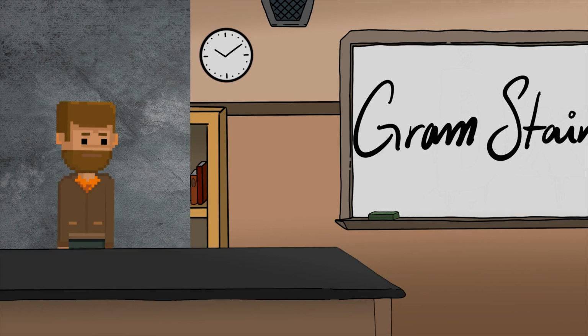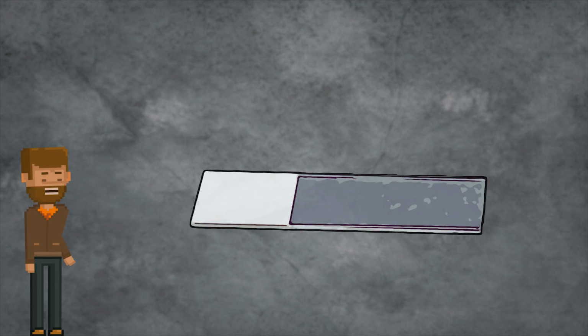So let's get started. The first step in gram staining involves making smears of each culture. Then you're going to let them air dry and then you're going to heat fix them. So to do this, you're going to start with your inoculating loop. You're going to use it to put a few drops of water onto your slide. Then you're going to aseptically transfer some bacteria into those drops of water.